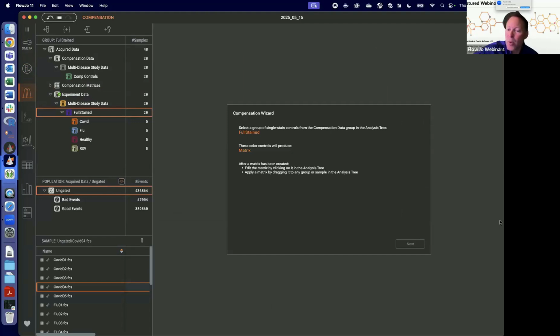Let's see. So there's a question from Maria, an interesting question for QC. How do we report that for a publication if things were excluded? The things that we've always suggested for folks to use in a publication is that they ran a QC algorithm, and it's generally a particular algorithm. I guess we should give ours a name other than kind of like Flow AI, so that you can tell which algorithm you used and which settings that you used. So you would say, I ran this algorithm, I used all the defaults, or I ran this algorithm, I used all the defaults plus turned on remove outliers.